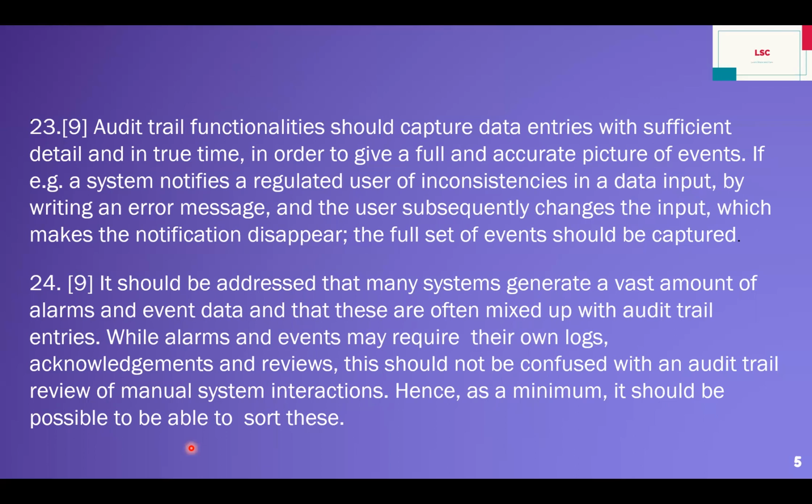But what the concept paper is saying is that the acknowledgement and review of alarms and events should be separate from your audit trail, because the audit trail is related to manual system interaction with your stability chamber. We should not confuse it with the alarms and events happening on that chamber, which we acknowledge.